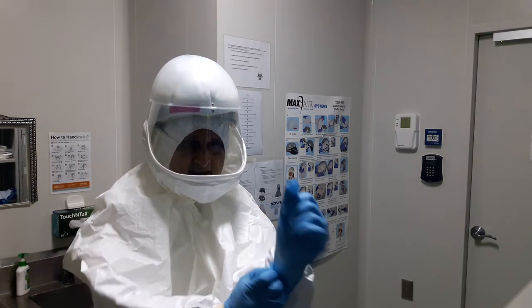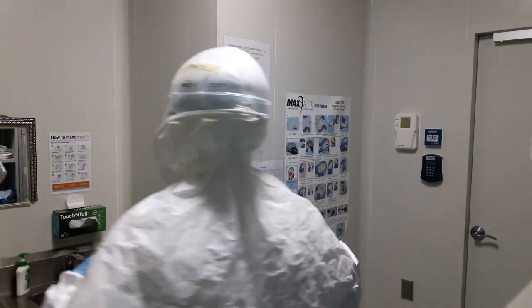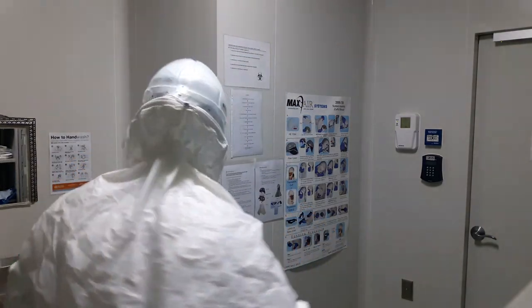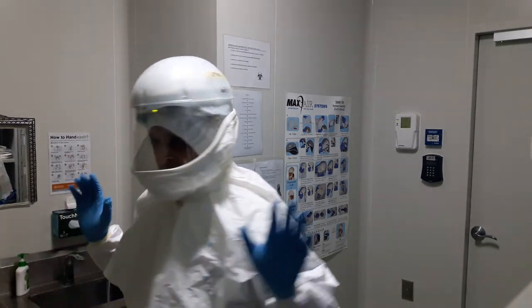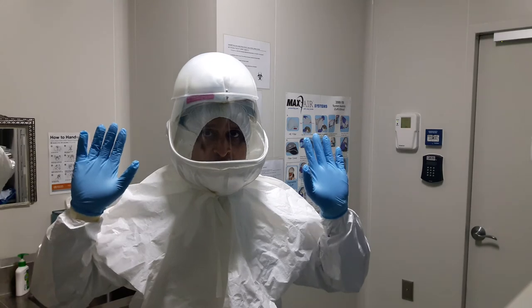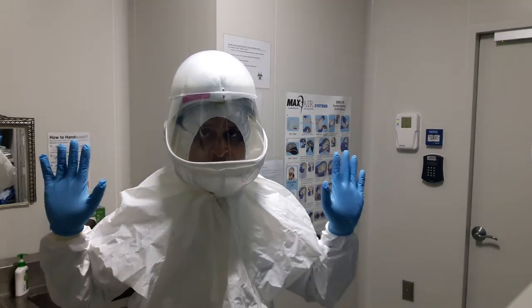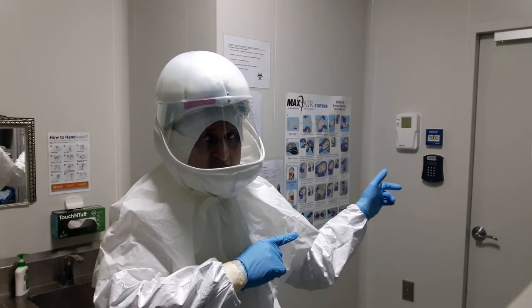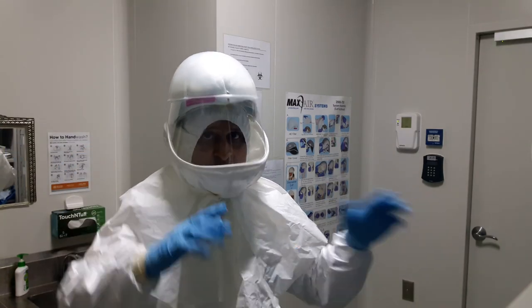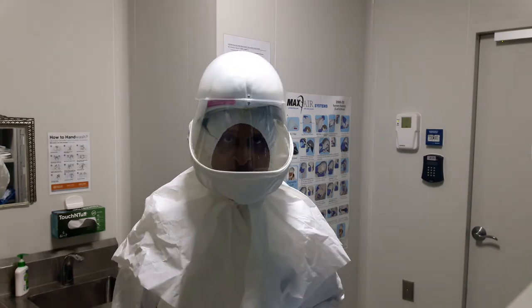As a final check, you need to look into the mirror to check everything is in order and your safety suit is in place. That is how you basically don, or wear, personal protective equipment prior to entry into the lab. Thank you very much for watching, and we're going out. Stay bio safe.